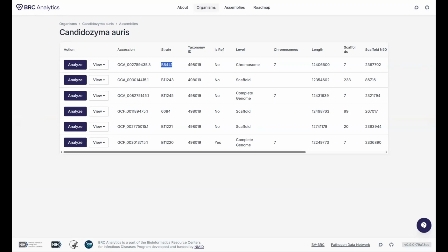Okay, so the general idea is that we have organisms, we have assemblies, and in this list of external resources, we're going to have more. So it's just an initial set at this point. But for example, again, if you know of established external resources specific to a particular organism, we can add them here easily as well.